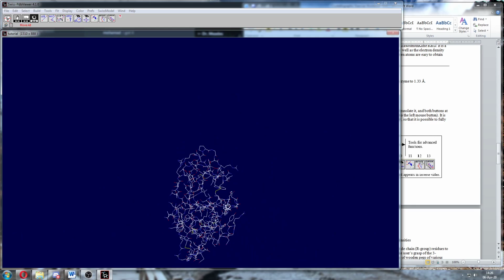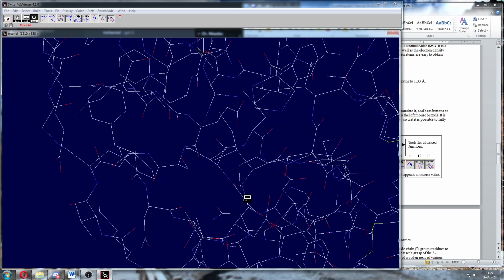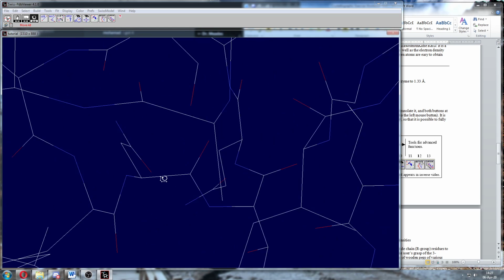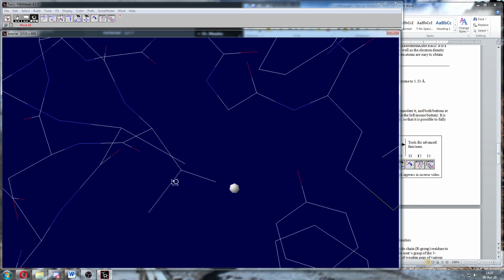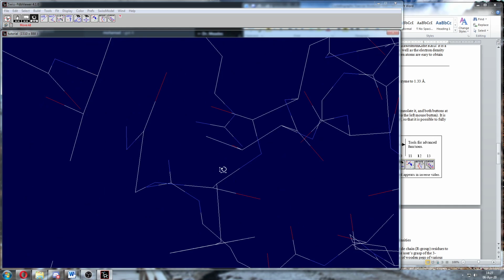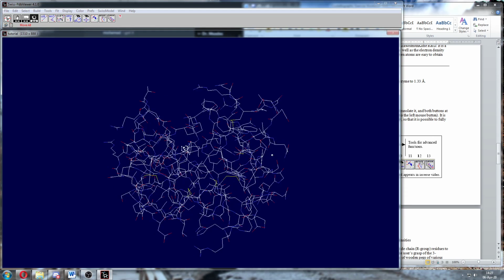So what if we wanted to see that tryptophan again, but I did something crazy like this. I'm completely lost. I don't know how to get out of this molecule, and for some reason I can't zoom out. It won't work. Completely lost. There is a get out of jail free button if you think about it. So over here on the top left, click the button. There's the hand tool, but to the left of it is this very left button. Click it and it resets the whole molecule. So just in case you get lost, you can always reset it and find your way out of there.